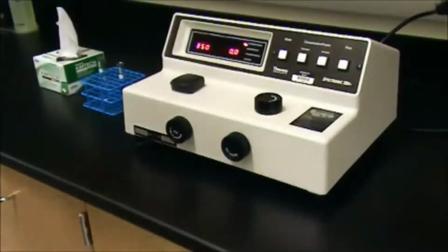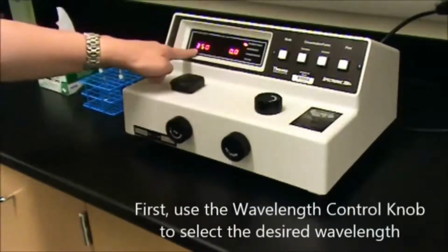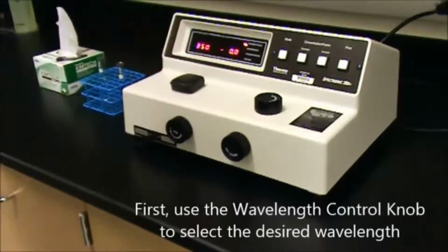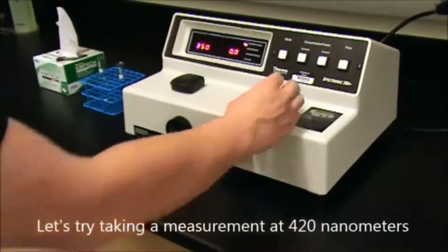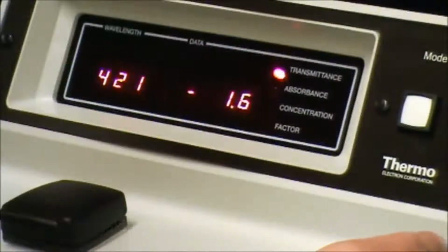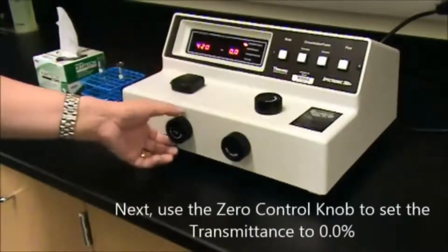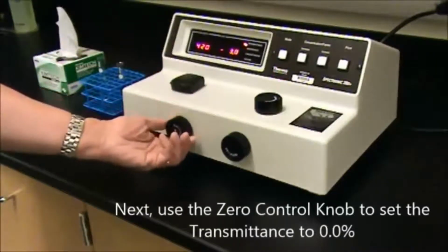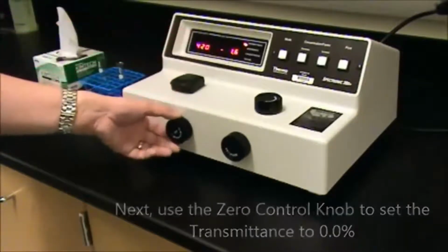In order to start taking a reading, you have to first set the machine up. So to do so, first thing you must do is use the wavelength control knob and adjust the wavelength until the wavelength that you want to measure at is reached. And let's go ahead and try taking a measurement at 420 nanometers. Next thing you need to do is, using the zero control, turn the zero control until you get 0.0 showing up on the display.